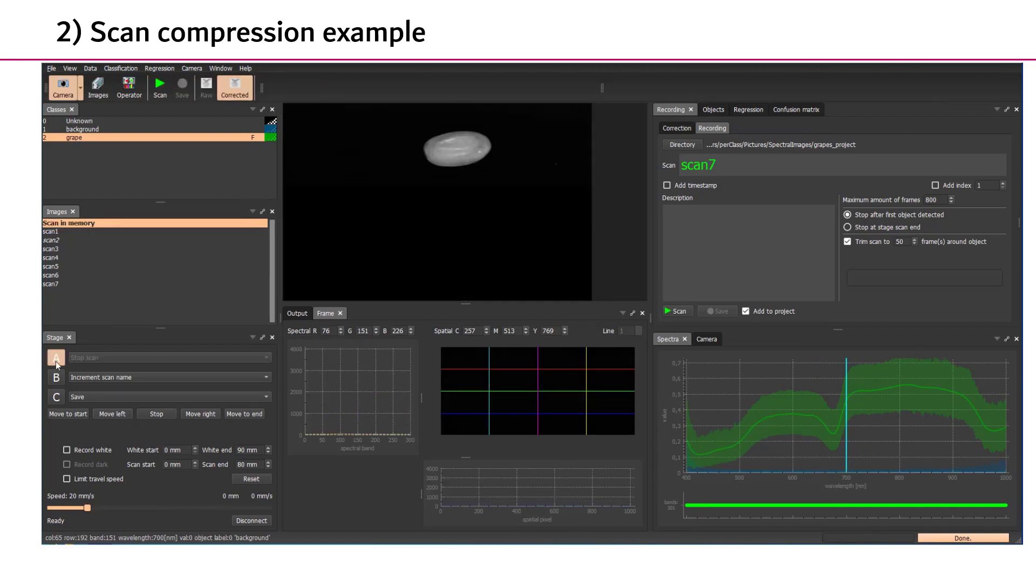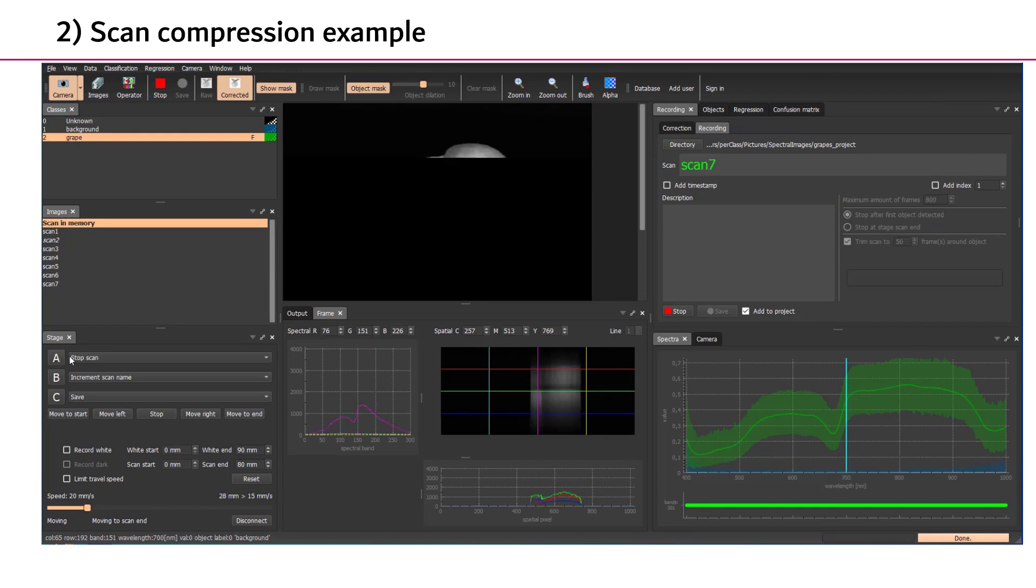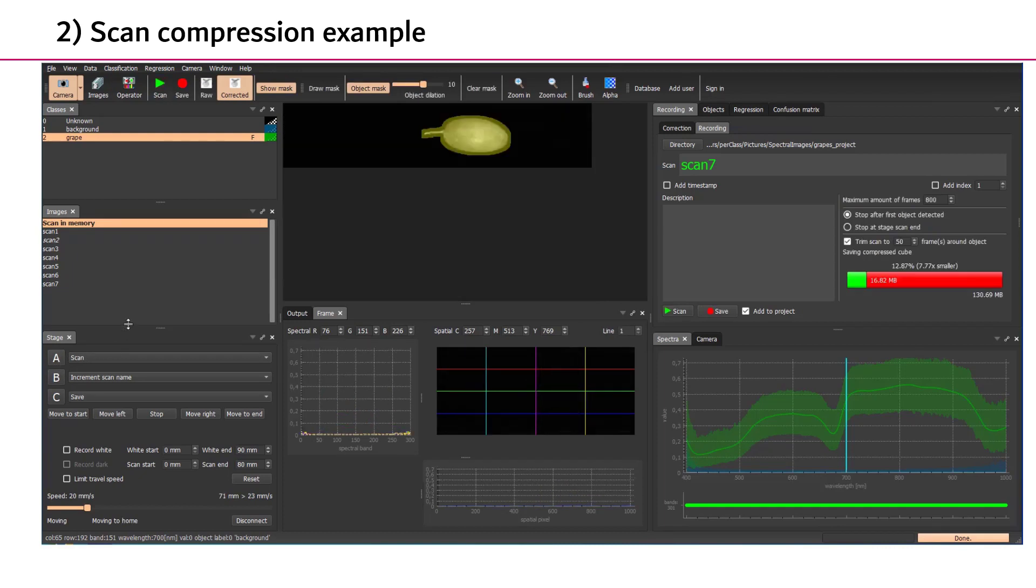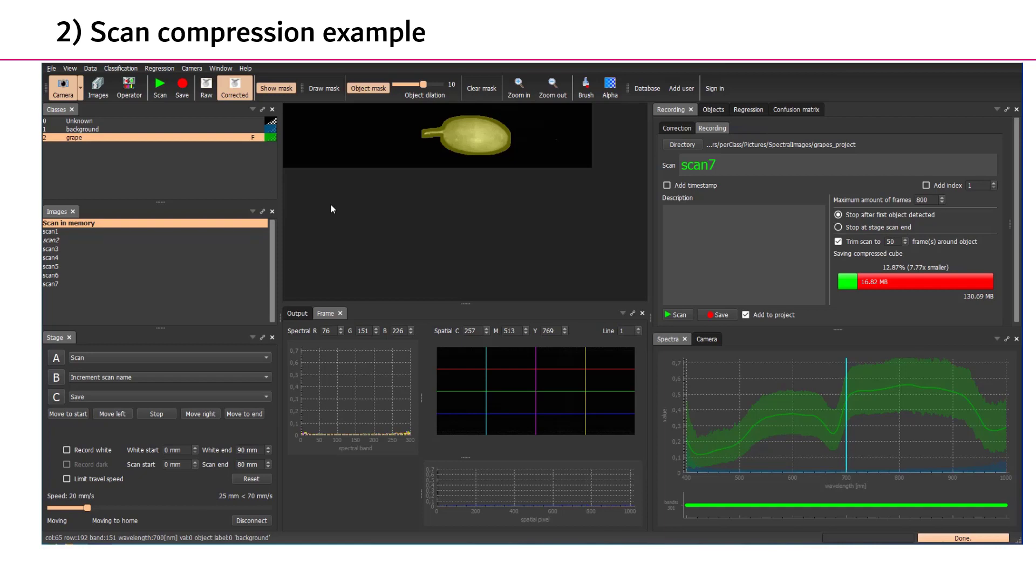When we grab another scan, you can see that Mira is now able to stop when object is detected and also trim the scans around the object. This helps us because we can place the product anywhere on the stage and we always end up with small scans.